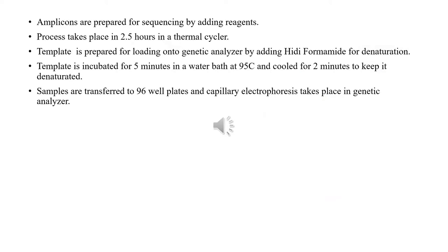Amplicons are prepared for sequencing, and the sequencing reaction proceeds for 2.5 hours in a thermal cycler according to the manufacturer's protocols. After DNA sequencing, the template is prepared for loading onto the genetic analyzer by adding Hi-Di Formamide, which can be used for strand denaturation. The template is incubated for 5 minutes in a water bath at 95 degrees Celsius and cooled for 2 minutes to keep it denatured. The samples are then transferred to a 96-well plate, and capillary electrophoresis takes place inside the genetic analyzer.